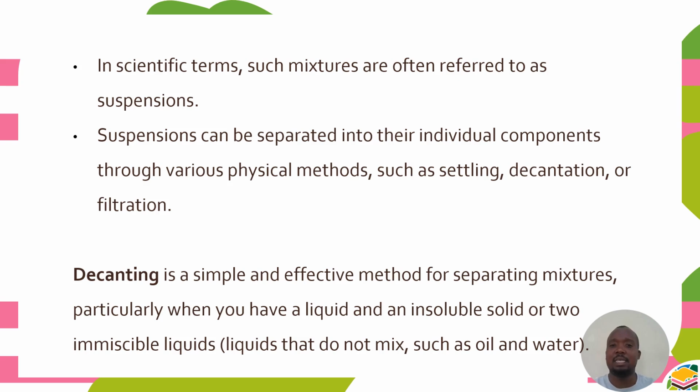Decanting is a simple and effective method for separating mixtures, particularly when you have a liquid and an insoluble solid or two immiscible liquids. By definition, when we say two liquids are immiscible, it simply means that they do not mix, they will not dissolve in each other. So you can separate them using decanting.